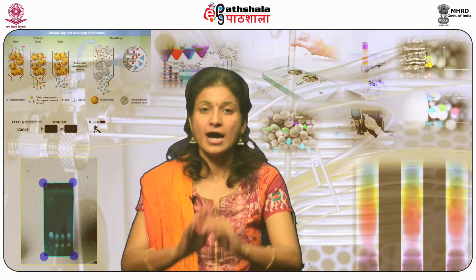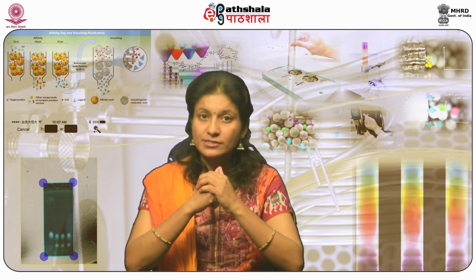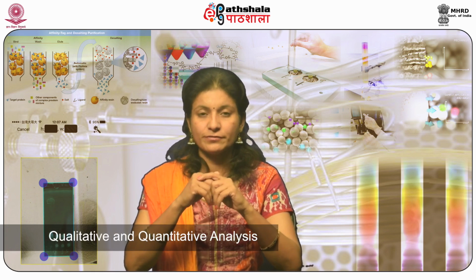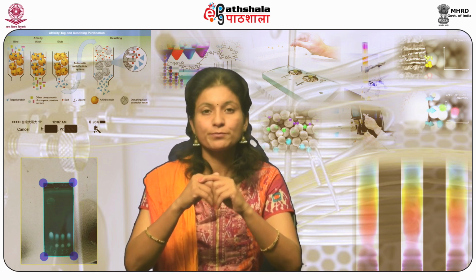So students, let us summarize what we have learned in this module. Firstly, there is unlimited scope of gas chromatography. Gas chromatography can be helpful in both qualitative, quantitative analysis as well as checking the purity of the compound.